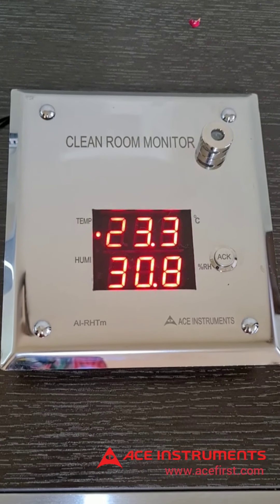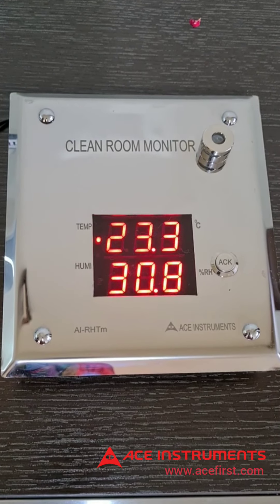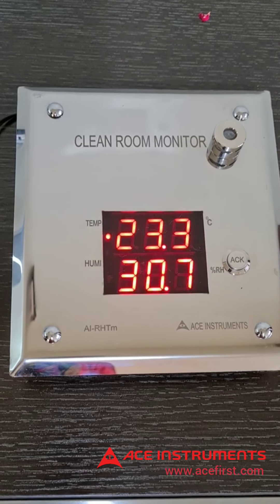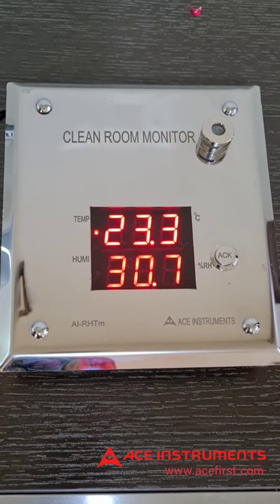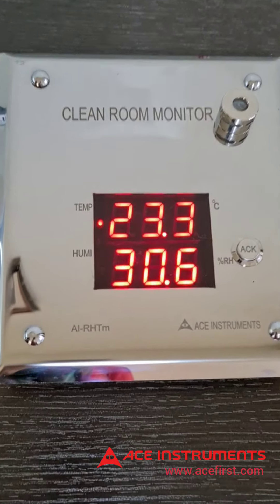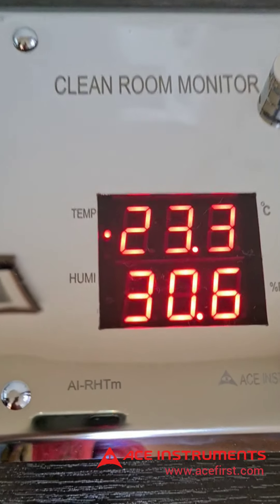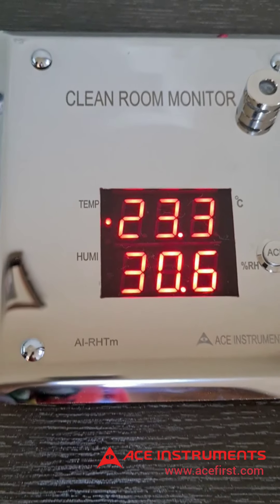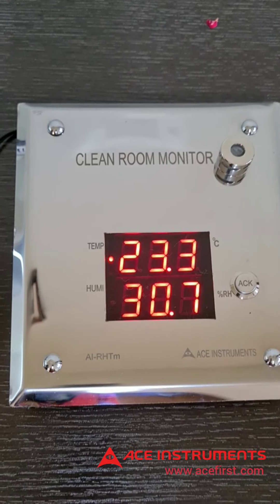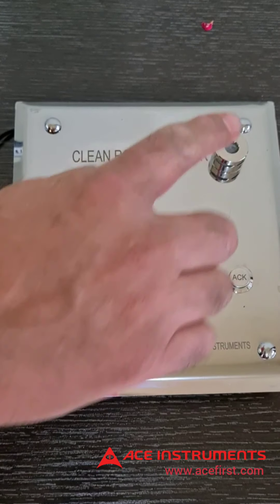Welcome to ACE Instruments. I'll guide you through a detailed video of the ACE Instruments digital humidity temperature monitor, model AI-RHTm. This is a flush mounting type humidity and temperature monitor with an inbuilt combination temperature-humidity sensor which is flushed to the front plate.